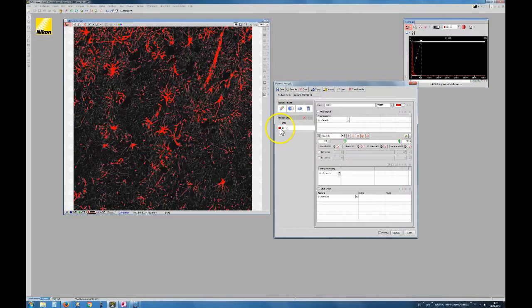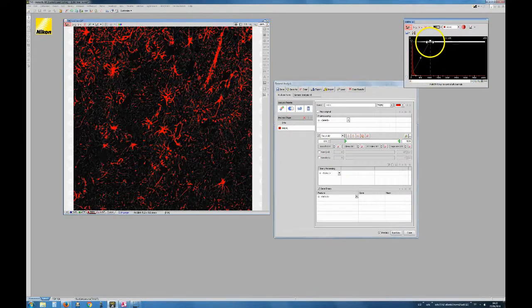And you have to remember that I have pushed the display, and depending on what you show, it will look like you have selected everything or not. So again, this is something that you have to consider, that we have a bias there. Okay, so now I say, this is not bad. I like it. So I have done my segmentation here.